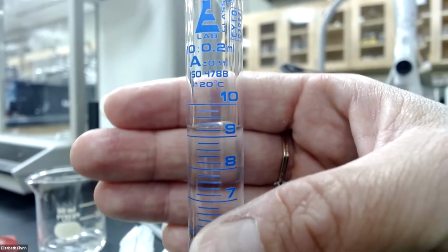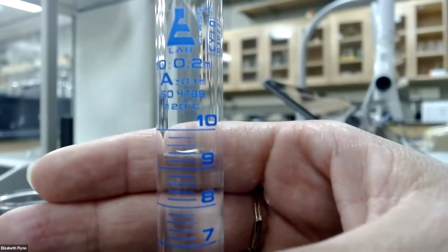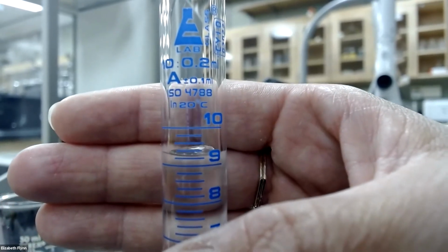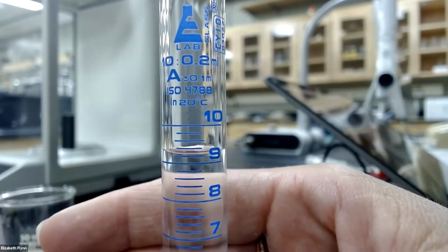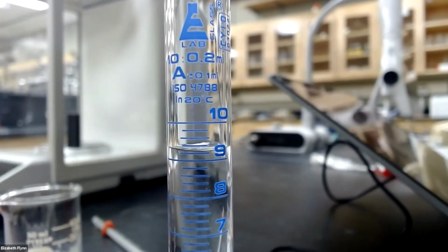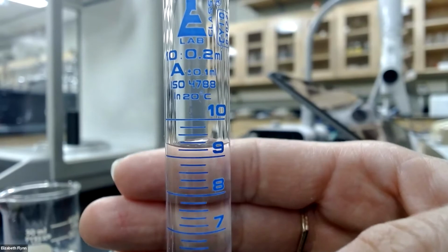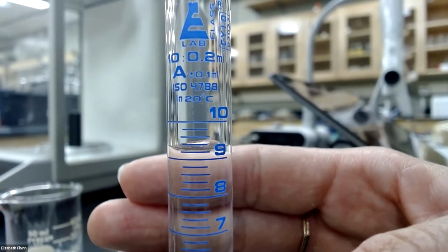There we go. Okay. So what do we think? Let's get this right about eye level here. And to me, the bottom of that meniscus, let's see, it's definitely above the 9.2. And so in this case, once again, we kind of just have to do the best we can at estimation. We can't say 9.25 or 9.22 or anything because we're already estimating once we get above the 9.2.